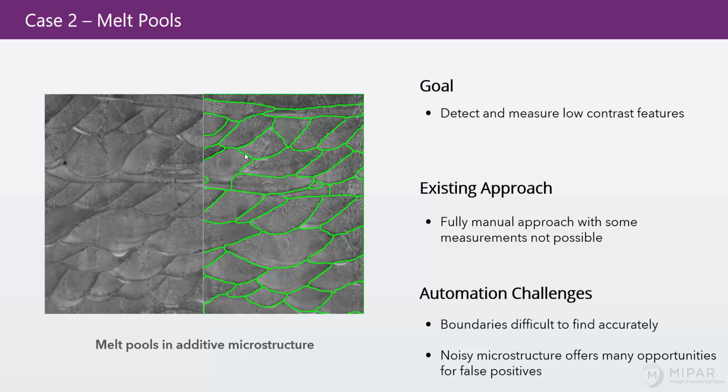Now, in this case, this was one that was done without any prior annotations. So melt pool sizing was simply done by drawing a couple of line chords through the major and minor axis to get an estimate of dimensions. And again, overlap wasn't really something that was plausible since this client was looking for an areal overlap, and guessing where this pool continues was impractical for many reasons. So let's just dive right into the demo.